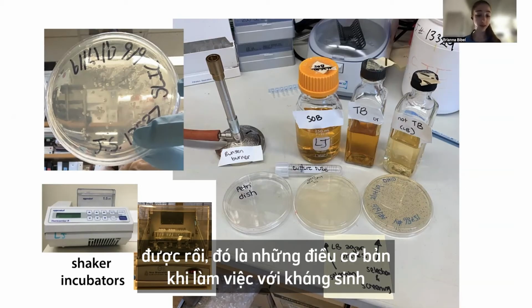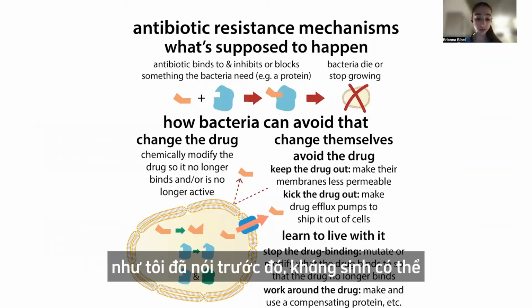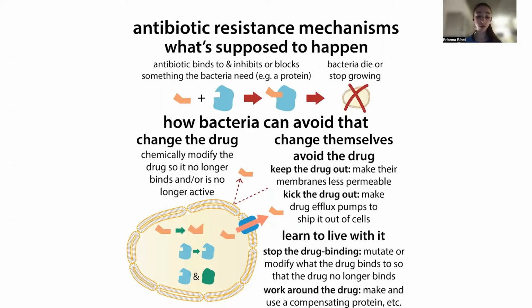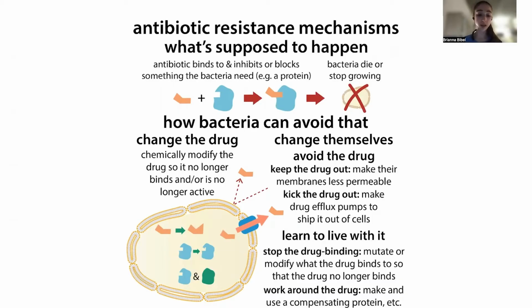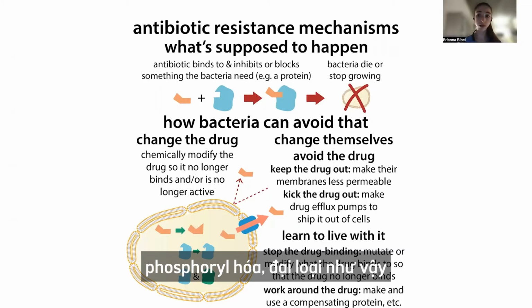Okay, so that's the basics of working with these antibiotics. Now let's talk a little bit more about the specifics for the different types of antibiotics. As I mentioned before, antibiotics can target various core mechanisms of the bacteria, and the bacteria can evolve resistance in different ways or acquire resistance in the plasmid through genes that do different things. Some of these genes are going to allow the bacteria to modify the antibiotic with methylation, acetylation, phosphorylation, something like this, so it's not going to bind.